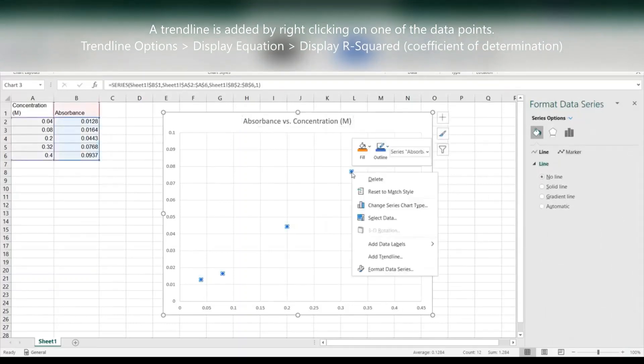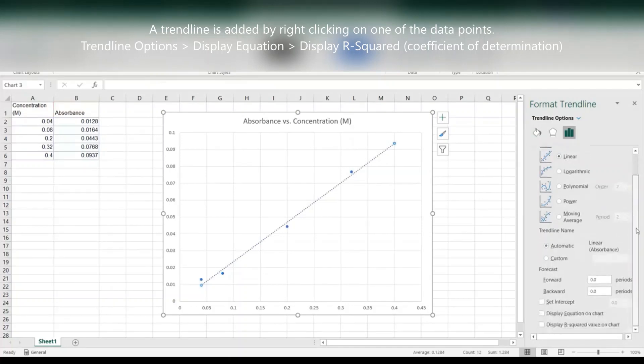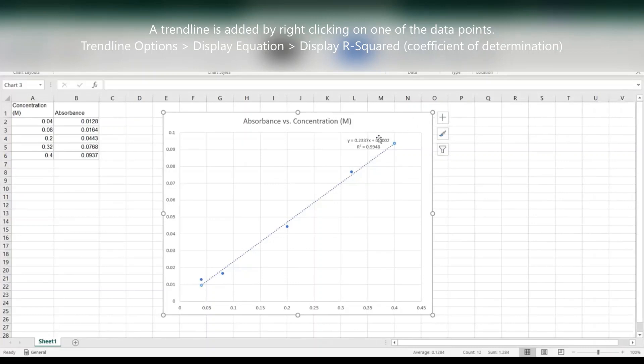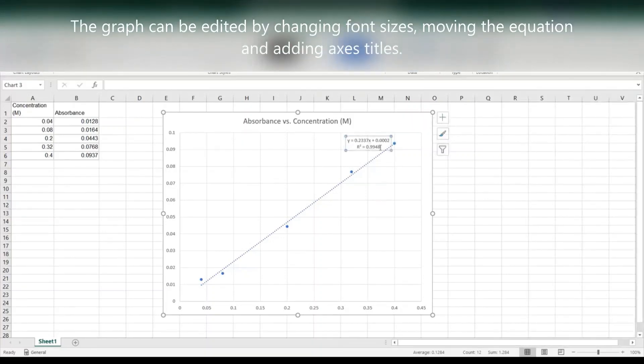Next what I'm going to do is add a trend line by right clicking on one of the data points. I do want to select linear and then I'm going to display the equation and the r squared value on the graph. Next you can see that you can resize the font for the displayed equation so I can make that bigger and I'm also able to move that to a better location on the graph so it's easier to read.